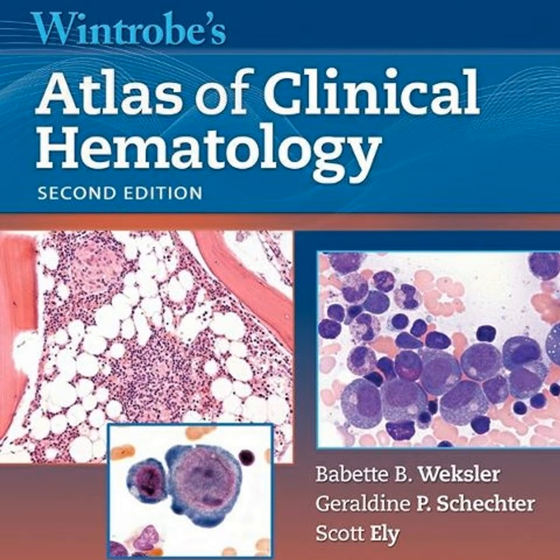Okay, so now we connect that visual foundation to modern precision. Let's talk about multiparameter flow cytometry, MFC. Right, and this is a huge shift. We're moving from looking at fixed dead cells on a slide to assessing live cells in a liquid suspension. The flow cytometer itself is firing lasers at individual cells as they stream by, measuring how that light scatters. That's right. Forward scatter, or FSC, tells you about the cell's relative size, and side scatter, SSC, tells you about its cytoplasmic granularity, its internal complexity.